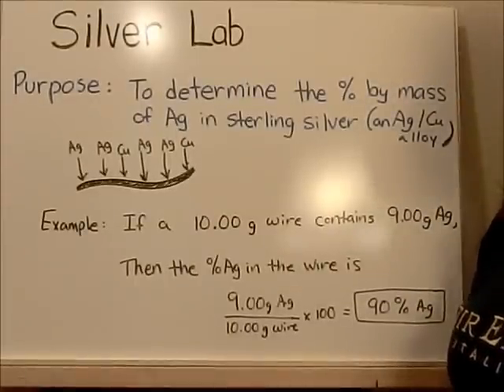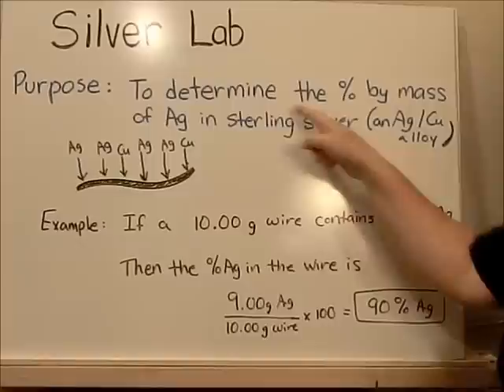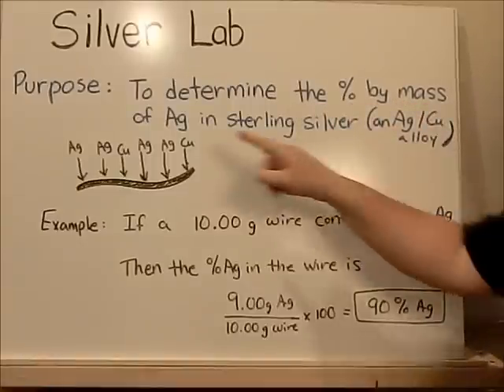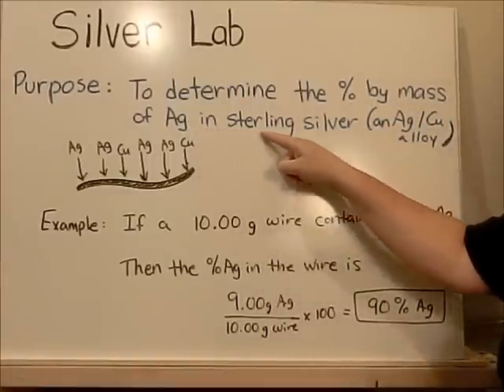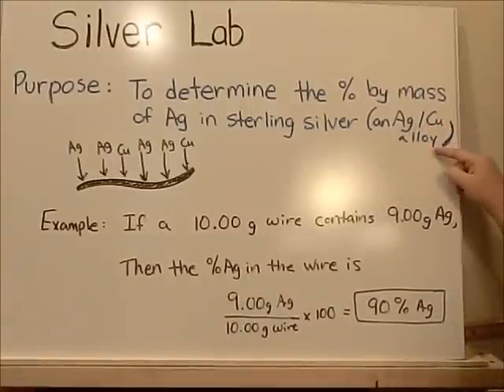So, tomorrow we'll be doing the silver lab. The purpose of this lab is to determine the percent by mass of silver in a wire of sterling silver. Sterling silver is a silver-copper alloy.